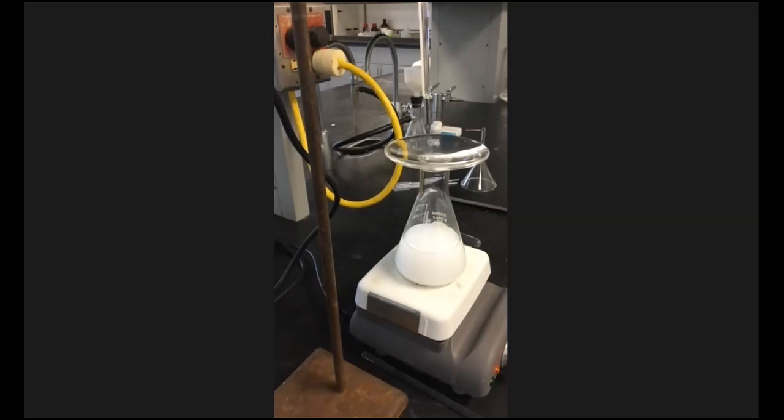And when you added more calcium chloride, you saw more precipitate. What would that tell you? Think about it. If all the precipitate was at the bottom and then we added calcium chloride and you saw a little bit more come out of solution, what would that tell you? It would tell you that there's no calcium chloride left. Do you follow what I'm saying?